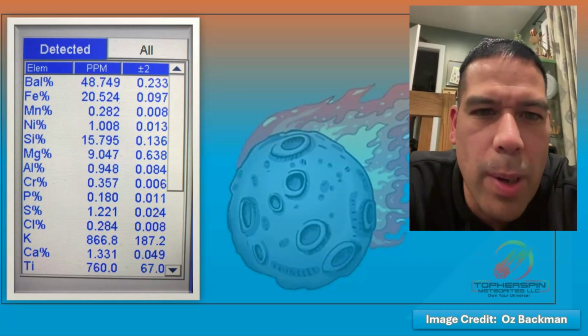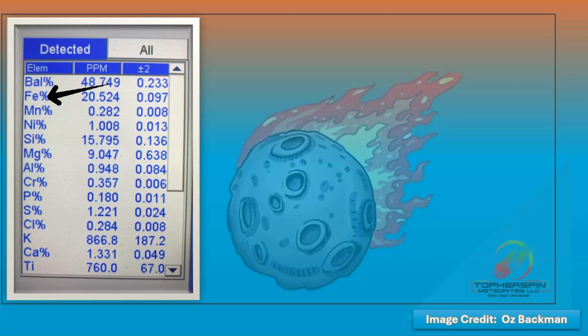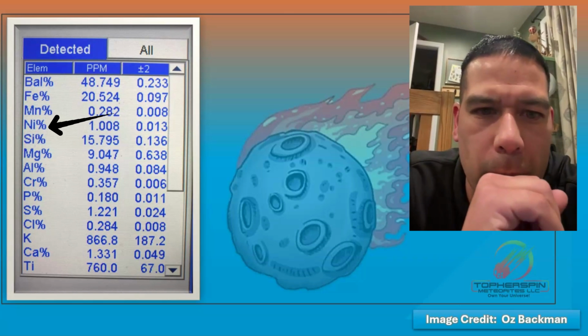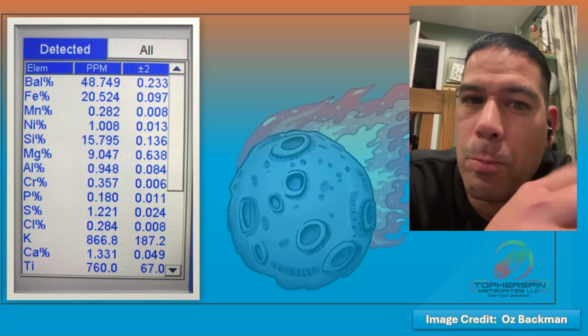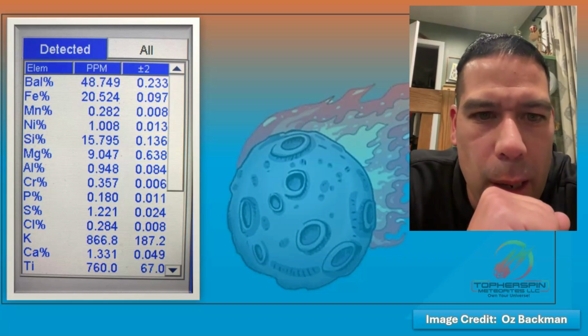What do we got here? We got a decent amount of iron, good, and again, that's a percentage. Fe. Nickel sitting at 1%, 1.008, nickel Ni. So that's a good reading in there, right? That's more nickel than you find in earth rocks, so that's a good thing.